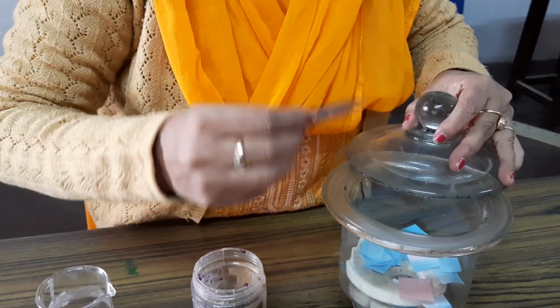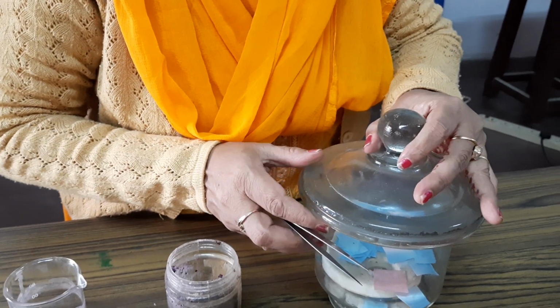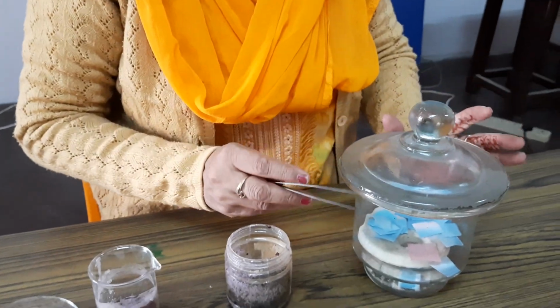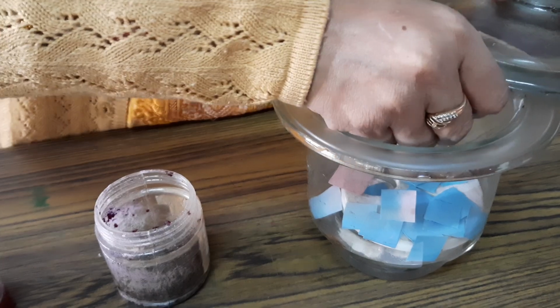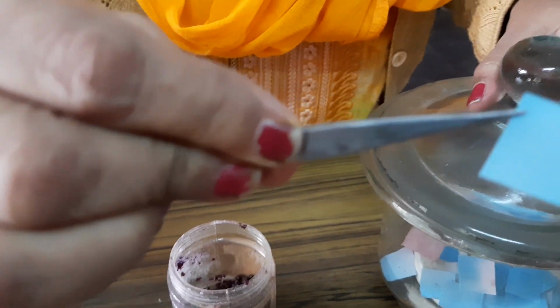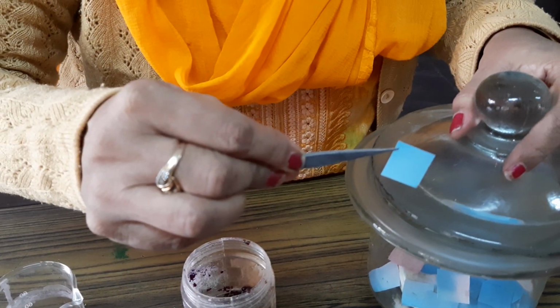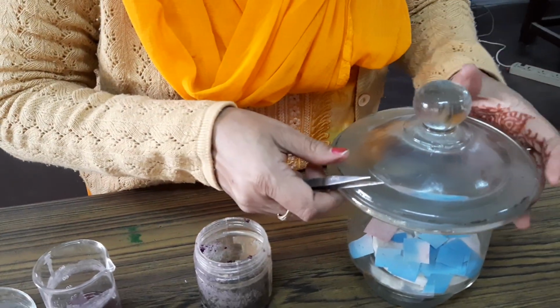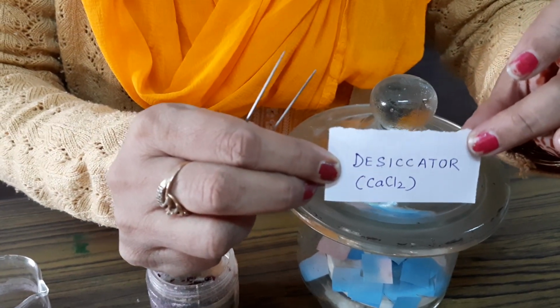Vaseline is to make it airtight. Now I will slide this glass on it, right? I'll keep it for a few hours, and I'll find that after some time the paper has turned completely blue, right? So dry cobalt chloride paper is blue in color, right? Why? Because calcium chloride has absorbed the moisture from the jar as well as from this paper. So you can see the name of the apparatus is desiccator.